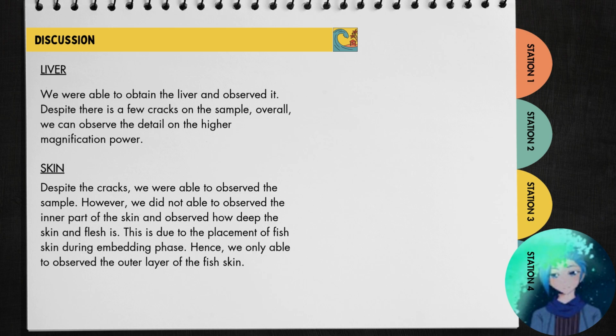Liver tissue. We were able to obtain the liver and observe it. Despite a few cracks on the sample, overall we can observe the detail at higher magnification power.